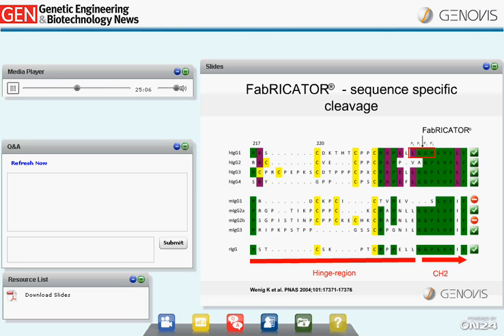Although these two subclasses have the identical four amino acid motif as human IgG1, the rate of cleavage is slower, which indicates that the correct amino acid sequence itself is not sufficient for optimal cleavage. Indeed, it has been shown that synthetic peptides that contain parts of the amino acid sequence covering the cleavage site are not cleaved, indicating that the three-dimensional structure also contributes to the substrate specificity.